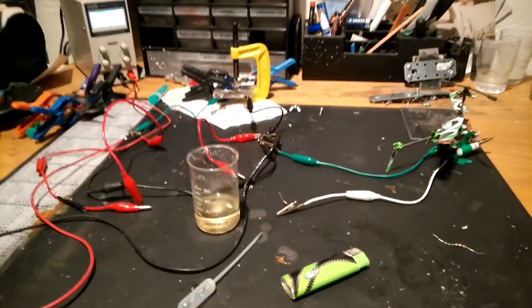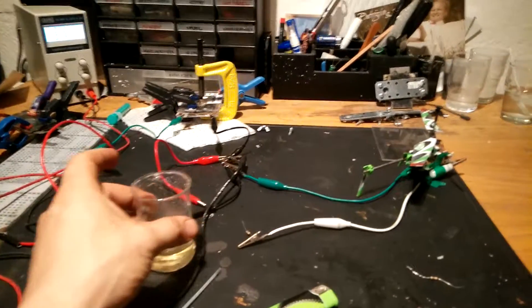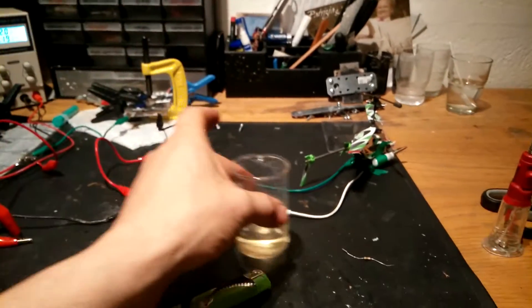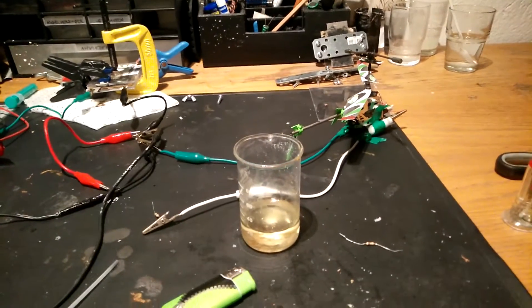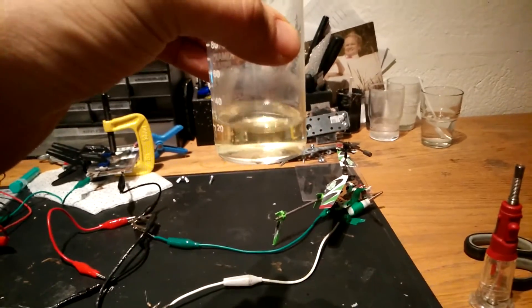Hi guys, I like to make activated carbon out of sugar by Robert Murray Smith's method. But the only problem is I have no zinc nitrate, so I made my own mixture with zinc oxide.